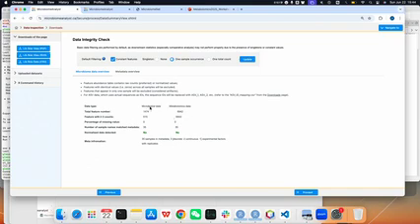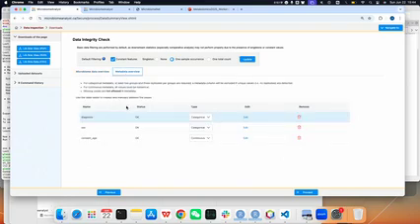We have the microbiome data, the metabolomics data's feature number, the sample number, and the primary metadata groups. We also have the same marker gene information, so I won't repeat it. You can also see the metadata overview.